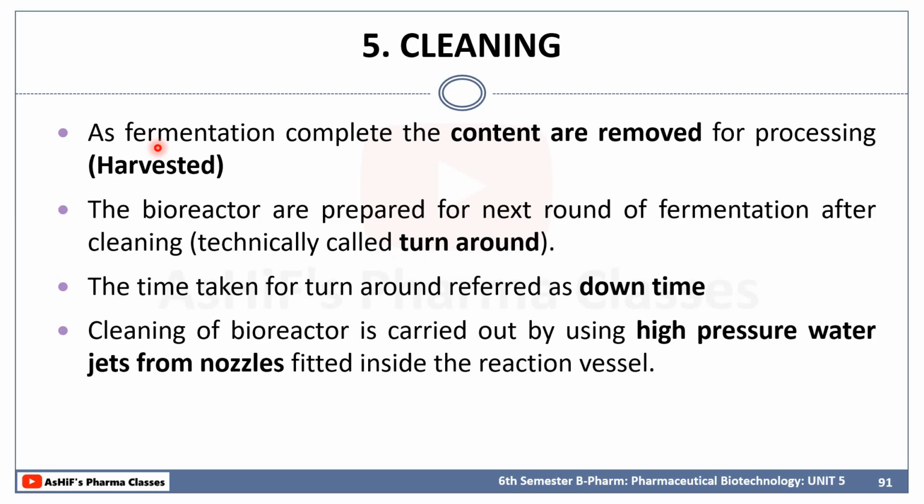Now after removing the product from the fermenter, we have to make the fermenter ready for the next batch of fermentation process. That is known as turn around.